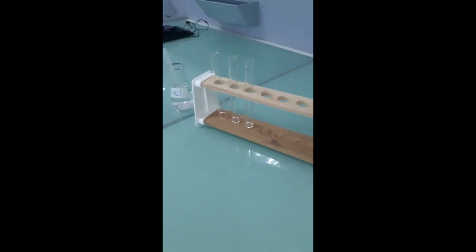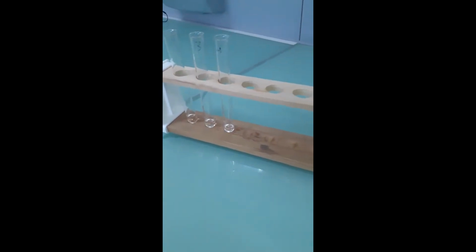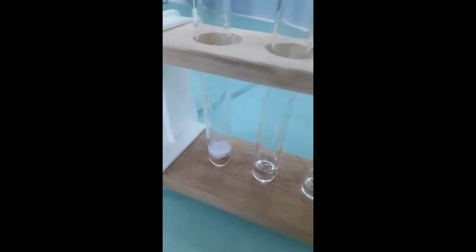Okay, this test we're going to use barium chloride solution, and the test solutions that you have here from your left are carbonate, sulfite, and sulfate. So we will just add the barium chloride solution to that at this time. This is for the carbonate. Record your observation, that's the carbonate.